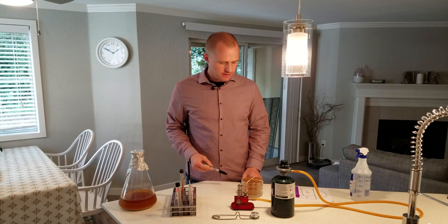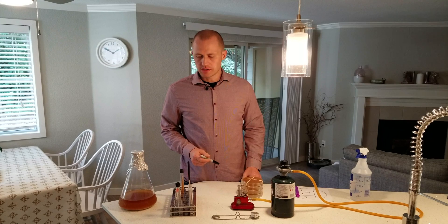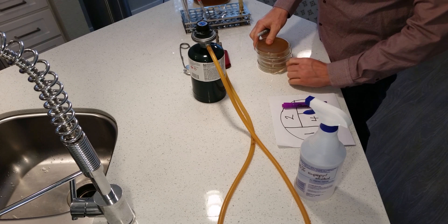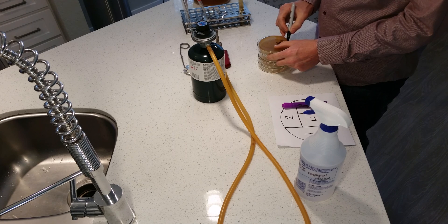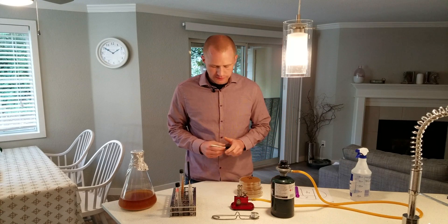And then you need a pen so you can write down on the back what it is that you are streaking. In this case I'm going to streak a Hefeweizen, so I'm going to write down the type of yeast — Hefeweizen — and the date, the 22nd of August. Then I initial it so we know who's done it.